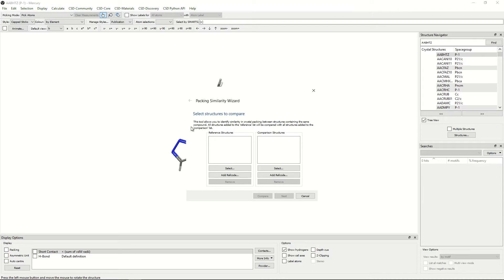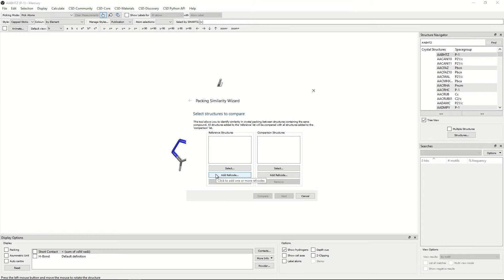This will bring up a window which will allow you to choose which structures you would like to compare. You can do this by either clicking select and adding ref code lists, conquest sets or mercury files of saved structures, or you can add your structures by clicking add ref code as we will today.